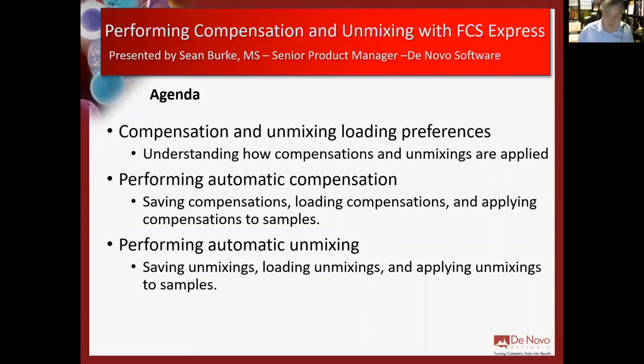Again, I think the important thing to remember is, with compensation, what preferences you're going to be setting up. With unmixing, if you set that unmixing as the default, any data file that you load in, or any data files that you load in and move between, are going to automatically use that.